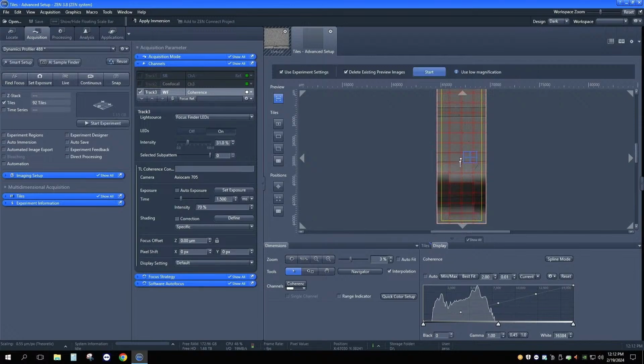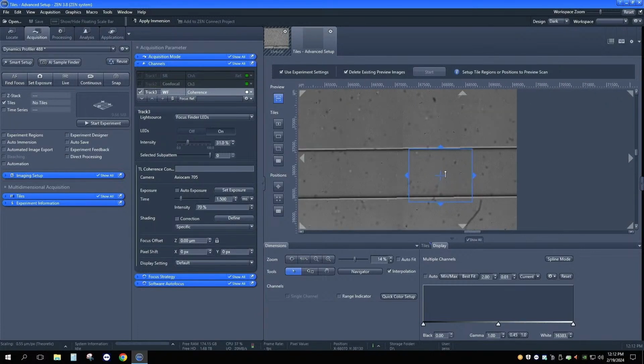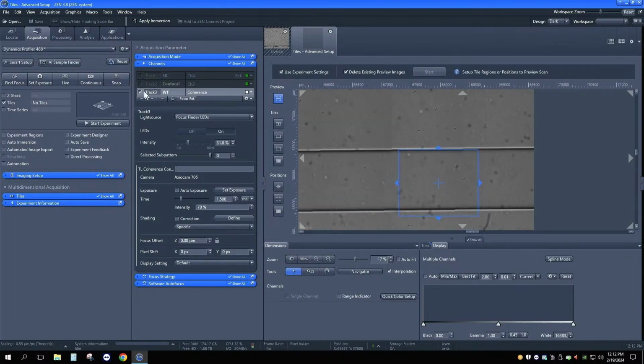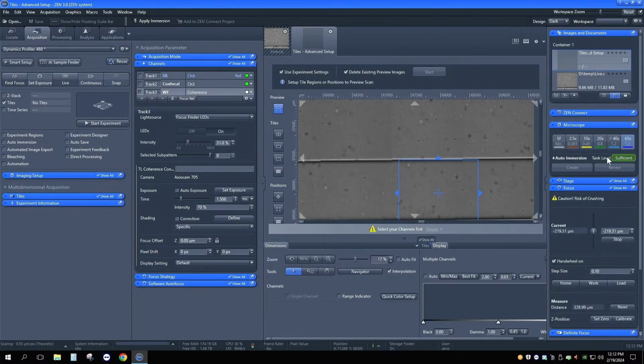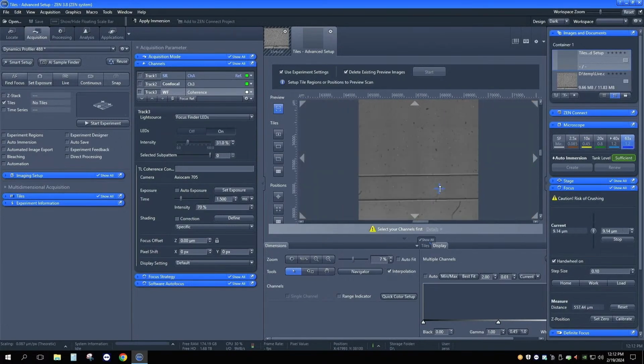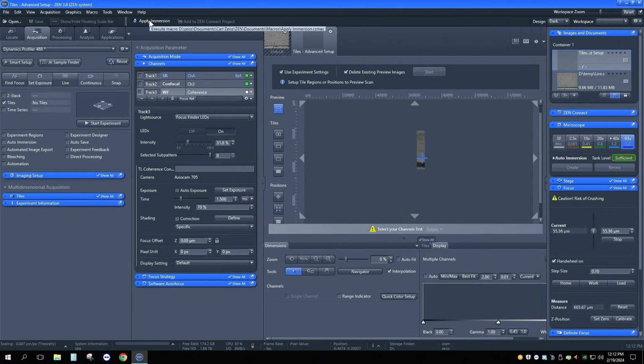Okay, now that we've done that, I know that I'm flowing rhodamine 110 dye through this third channel here, so I'm actually going to switch back to a 63x objective, and then I don't have to lose the context here. I'm just going to move out of the chip. I have a little apply immersion macro that we've developed here, but you could certainly just double click off after going to load. Basically, what this immersion macro does is apply our water.